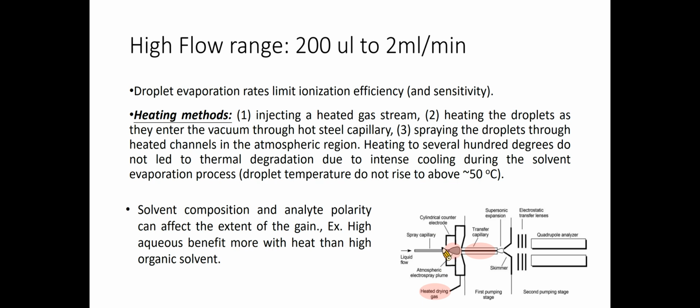As evaporation is endothermic, heating to several hundred degrees usually does not lead to severe thermal degradation. In addition, the solvent composition and analyte polarity can affect the extent of the ionization gain from the heating process. For example, high aqueous solvents benefit more from heat than high organic solvents.